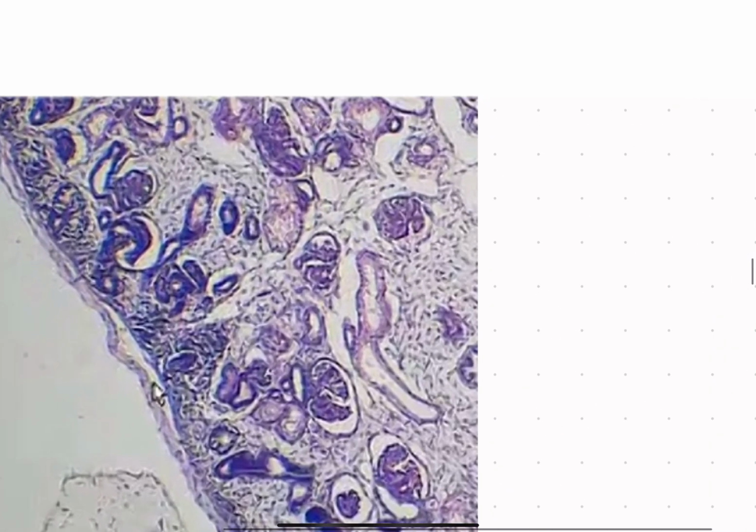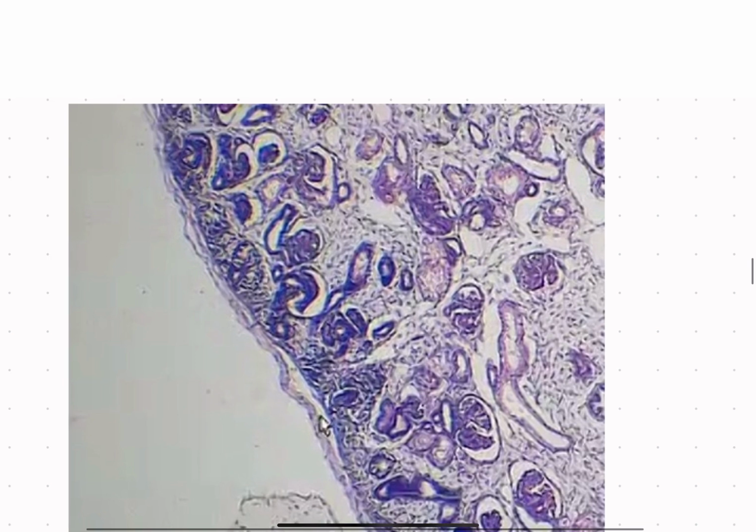They could still ask you about the differentiation of nephron here, which is this. They can still ask you about the mesenchyme. They can ask you about the blood vessels, which is such an insignificant structure in comparison with all the other structures we have to learn about, because it's such a typical and basic structure, but still something that they can bring up just to test and see if you can differentiate a nephron from a blood vessel or a renal corpuscle from a blood vessel, and so on.